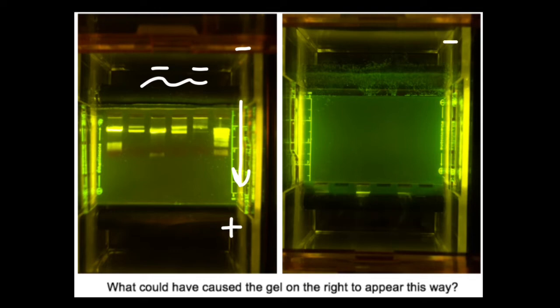Again, we have the negative electrode here and the positive electrode here. We loaded DNA or RNA in these wells.